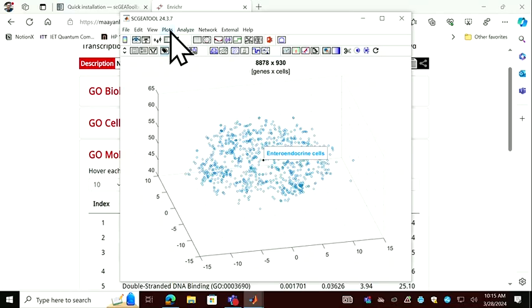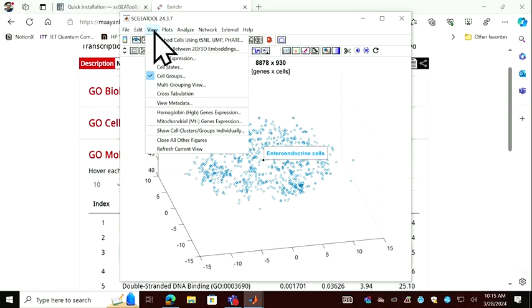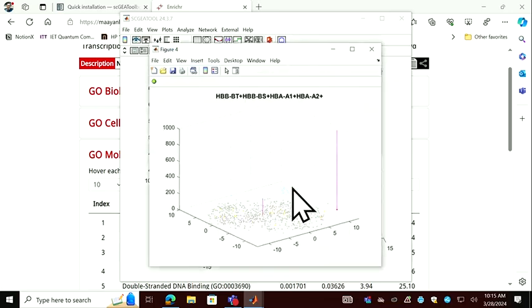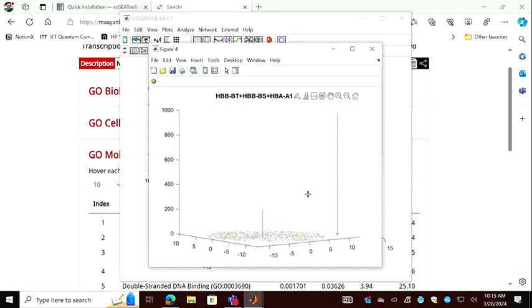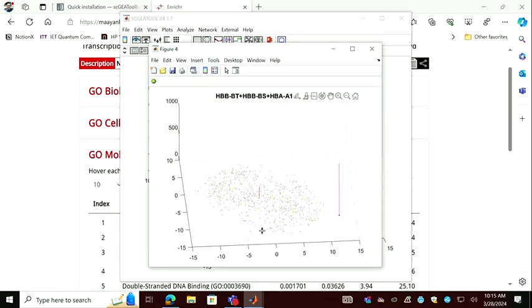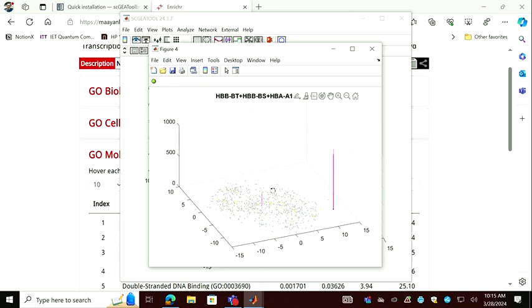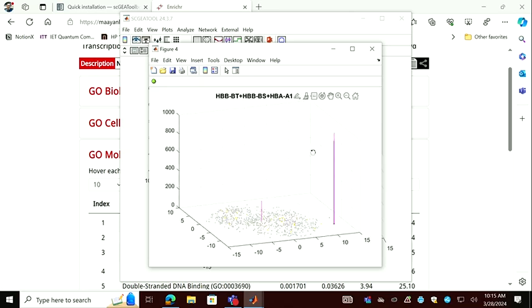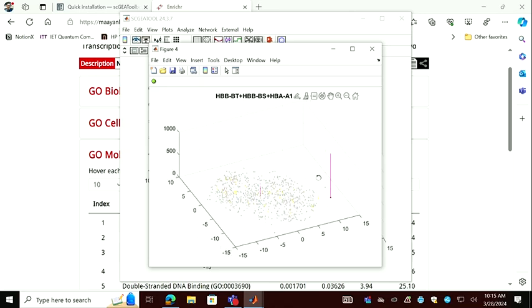hemoglobin genes. If you look at this plot here to view hemoglobin gene expression among those cells, you will see some of those cells contain hemoglobin genes. Normally they shouldn't. Those come from blood cell contamination. Yeah, you can delete those. Clearly not meaningful.